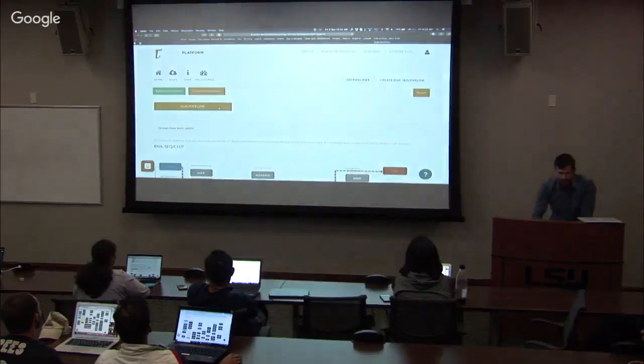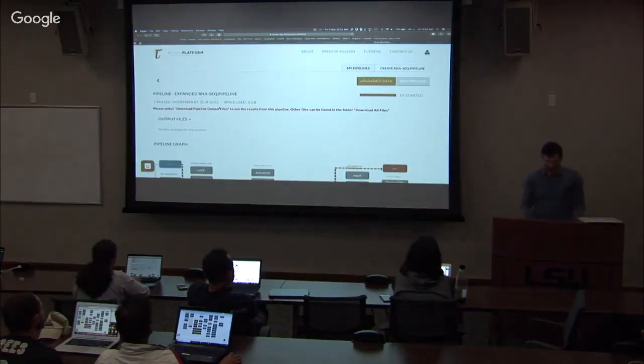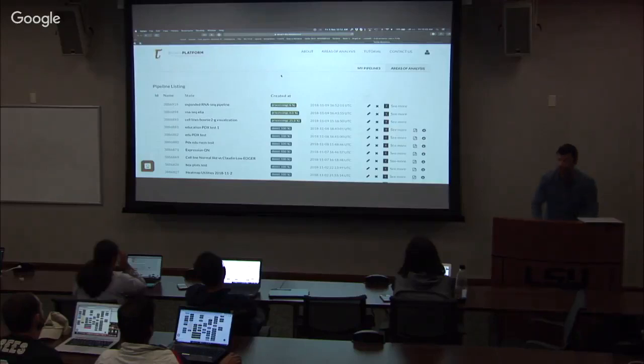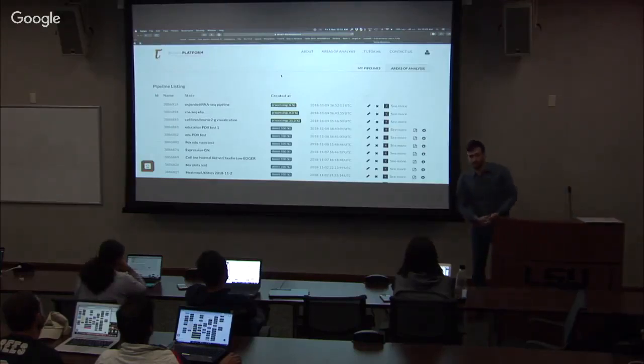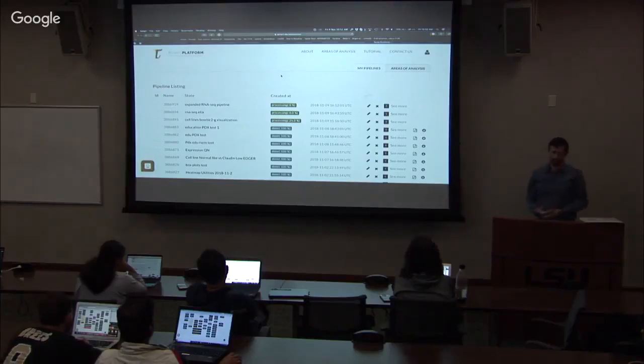Okay, so if you want to play around with this, you can run several of these pipelines and then take a look at the different results. Now, this will take some time, right? So don't expect this to be done in 5 minutes. These are actual FASTQ files, and we have 11 of them. Each one is approximately a gigabyte in size. So probably in a couple of days, you'll see the results. So you'll get an email notification. This is done. You'll click through, and you will be able to see the results.